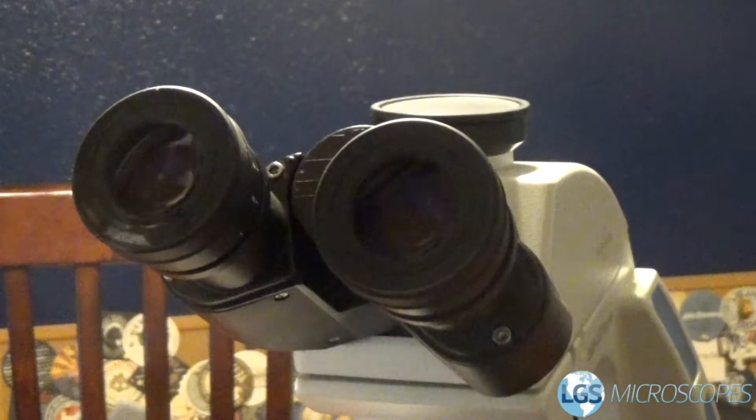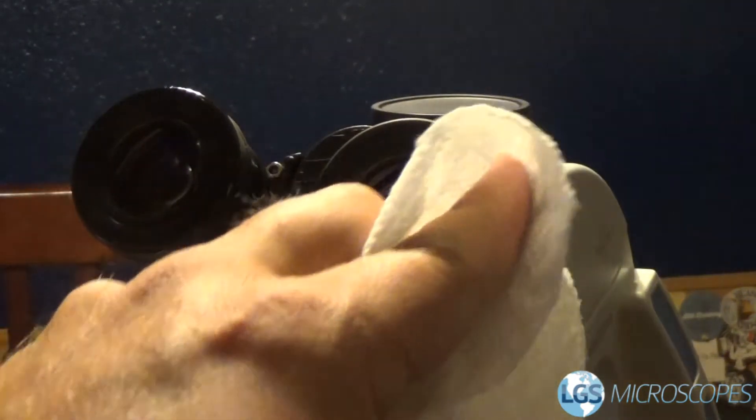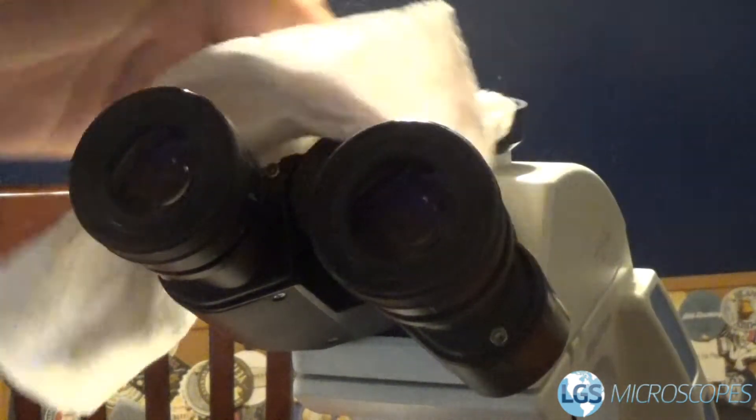And then we're going to probably grab our eyepieces next. So we want to just wipe the surface of this down, and you can easily do it without touching the lenses and smudging the lenses.